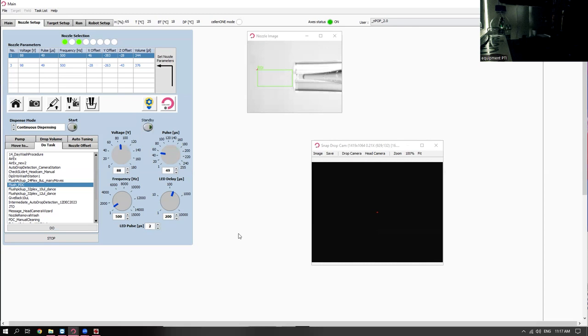That's my second question that I had, which is basically the degraded product from hemoglobin that the parasite takes up and accumulates. The amount of hemozoin crystal actually increases as the parasite differentiates. So at the later stage it's at a maximum, and at the ring stage it is small. That is basically what you will be able to see in the transmission. If there is more hemozoin crystal, that means the later stage, but if it's a small amount, it's the ring stage.